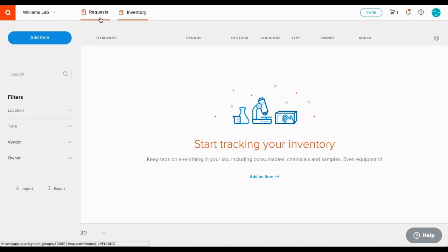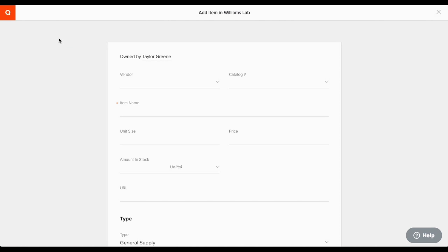Lastly, you can add an item directly from the inventory module. Let's do an example of this one. Click the add item button. Notice that the vendor and catalog number fields aren't required. This makes it great for tracking things created in your lab. For this example, we'll add an item we purchased.